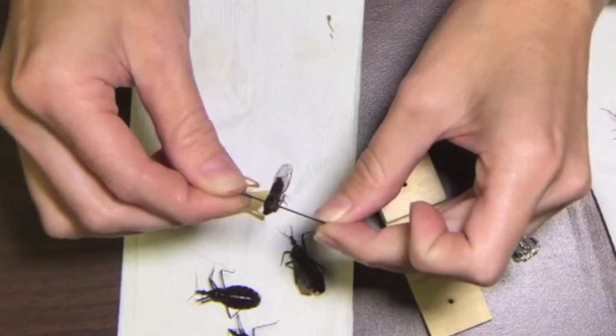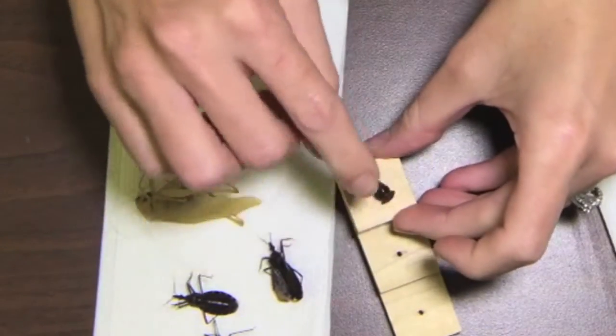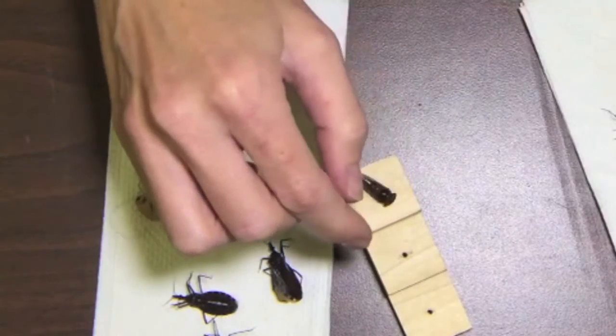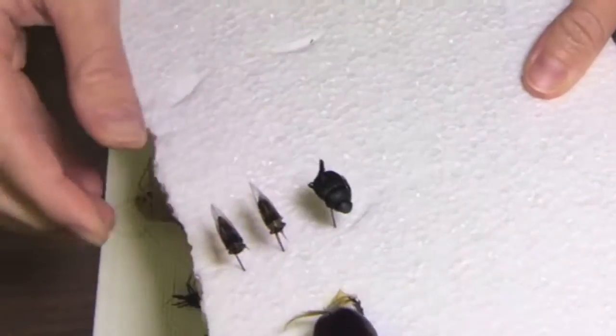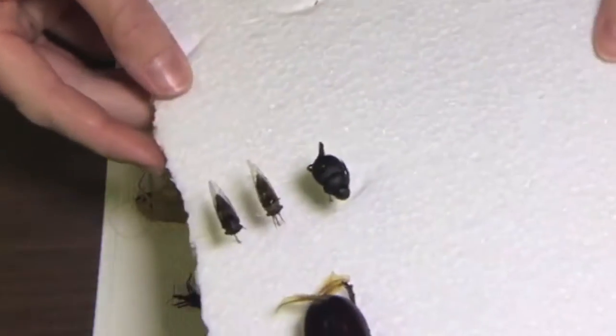He looks nice and straight. Then I place him next to everyone else — they're all about the same height.